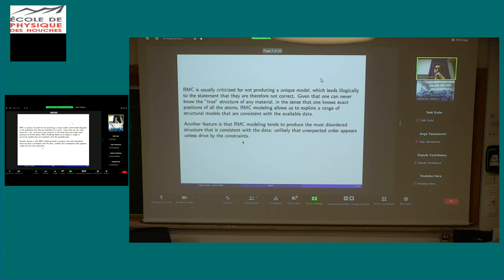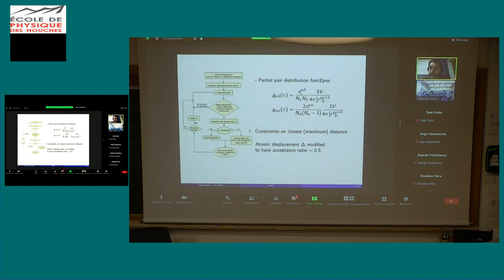Okay, so in the loop, may I? Yeah, sure. In the loop, let us take a configuration 1, C1. Once you set it up and get inside, I don't see any particular thermalization. Once you have a particular configuration, do you use some number of cycles for thermalizing or bringing the system to equilibrium? Yeah.